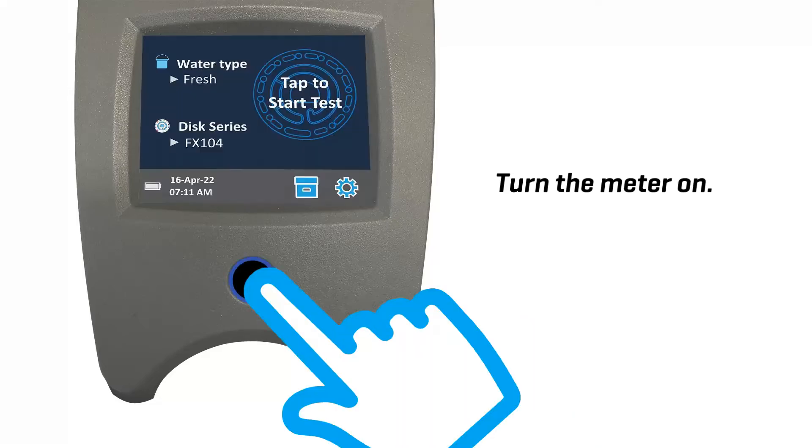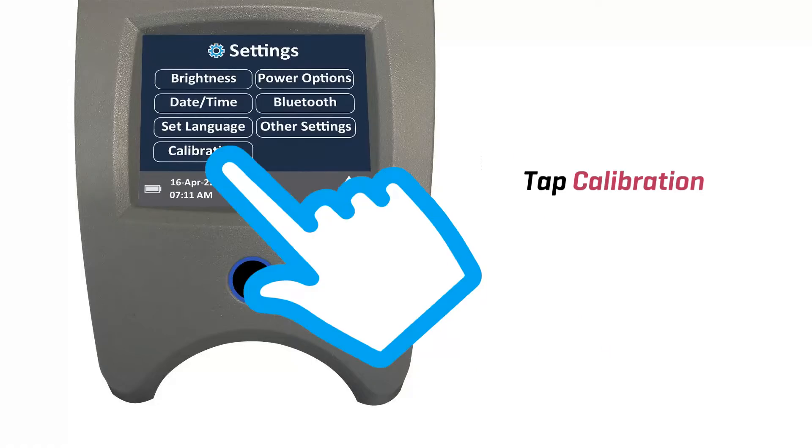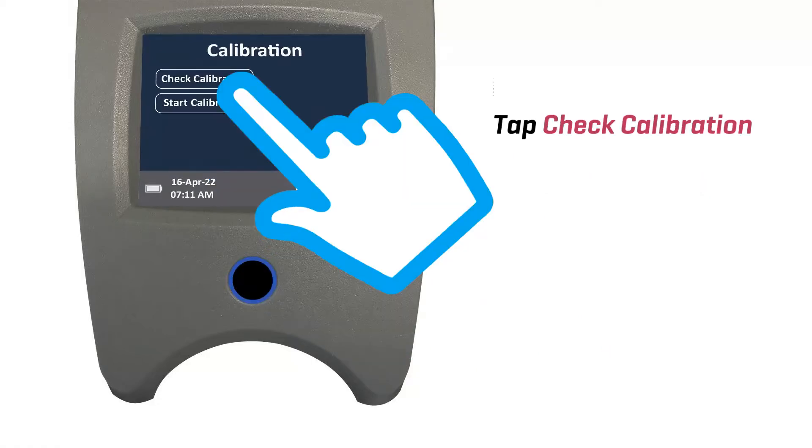Turn the meter on. Then tap the settings icon. Tap calibration. Tap check calibration.